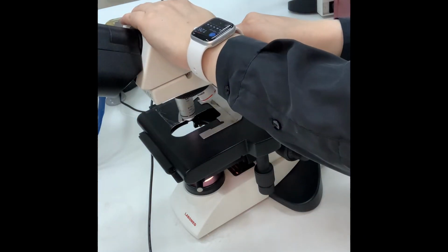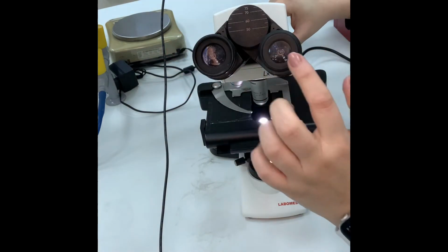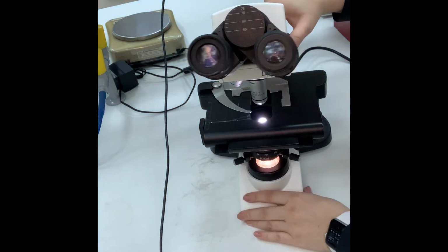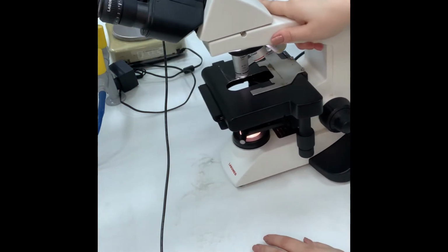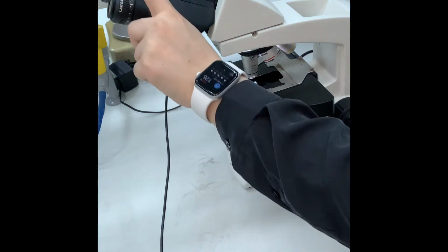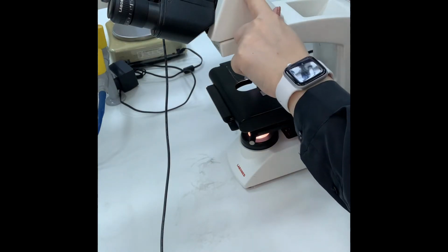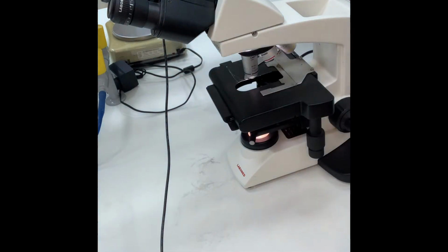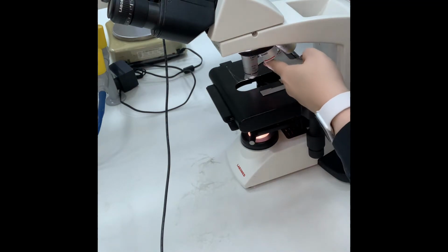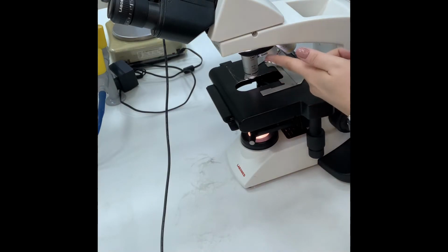Now this is the head of the microscope that carries the oculars, and to define oculars, these are lenses that you look through. So this is better. From top, oculars, lenses that you look through. Head, it carries the oculars. Revolving nose piece, it carries the objectives. What are the objectives? Magnifying lenses.